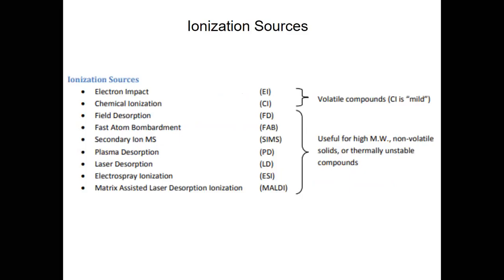After the samples are injected through a sample inlet, they go through an ionization source, where ionization happens.